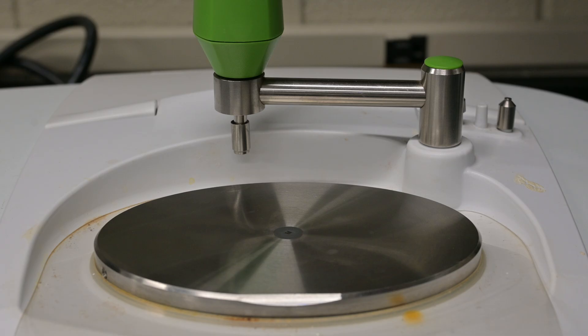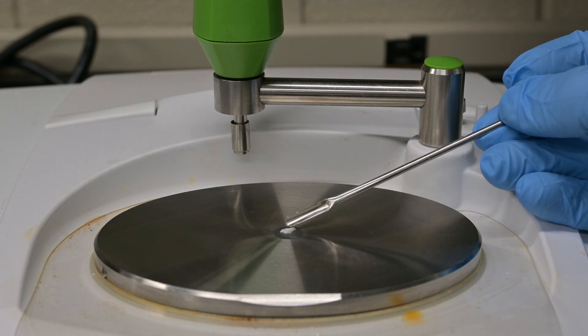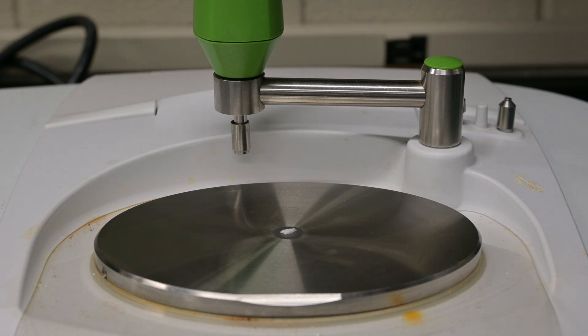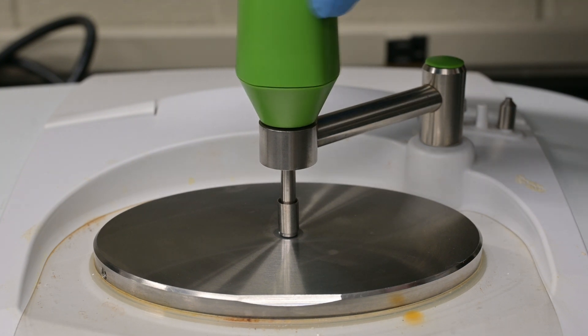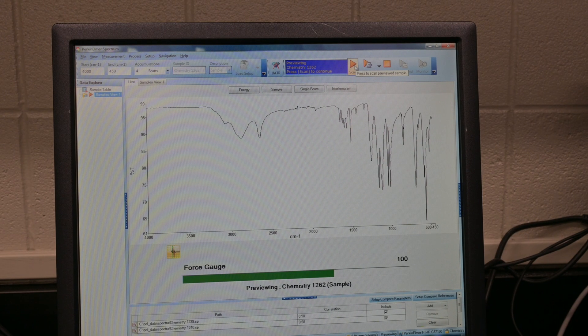To do this, we take a crystal of the sulfanilic acid and place it under the diamond detector. We then use the clamp to force it against the diamond detector so we get good data. We then run a scan.